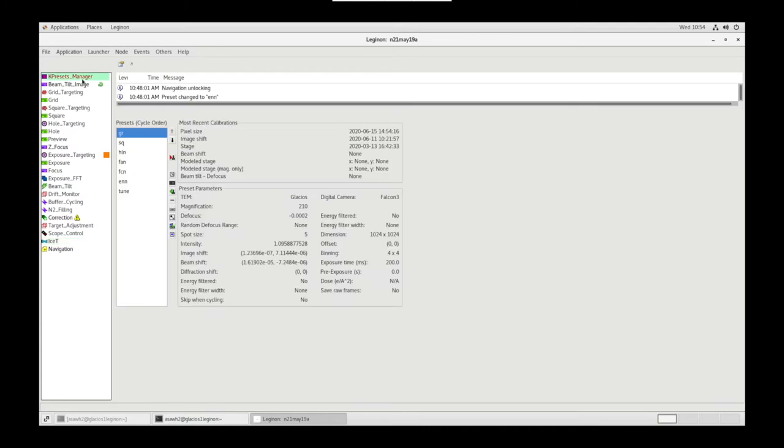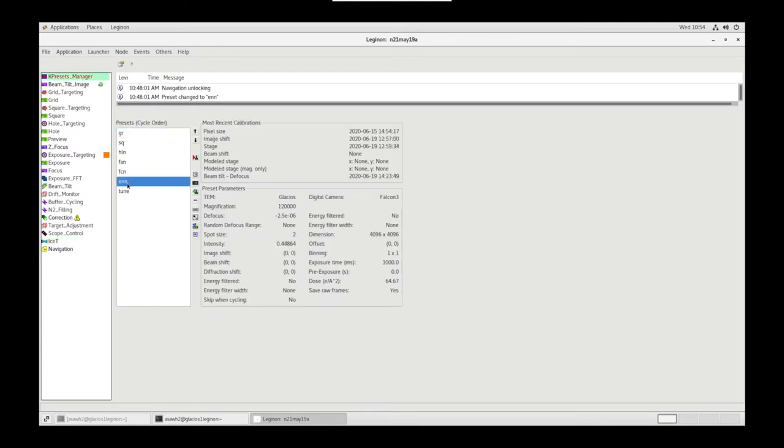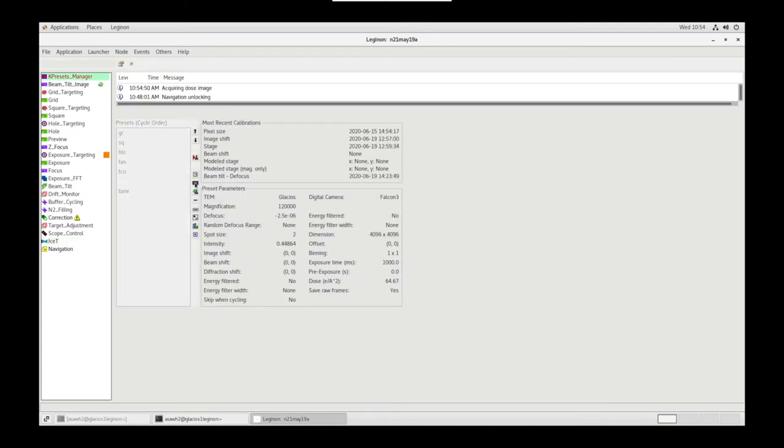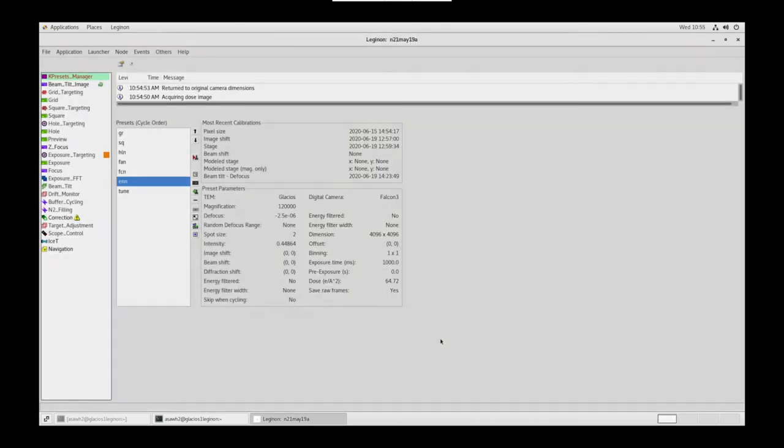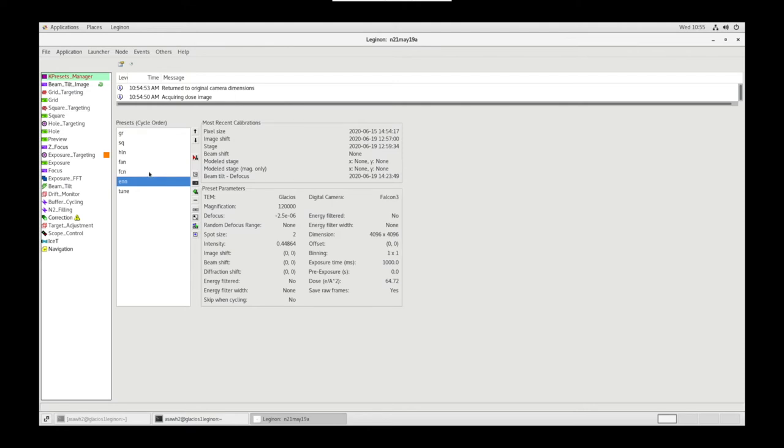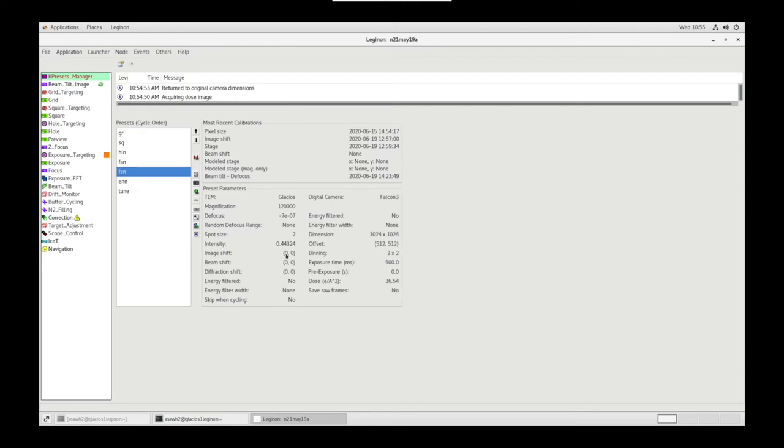In Presets Manager, we're going to go to ENN Preset and Acquire Dose for this preset. We want our value to be between 30 and 65, which it is. Select Yes. Let's make sure Image Shift and Beam Shift is 00 for ENN, FCN, and FAN.